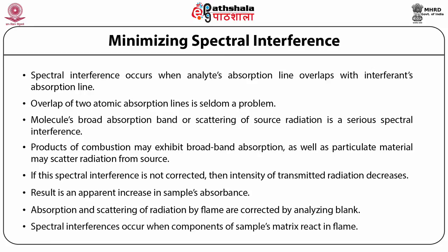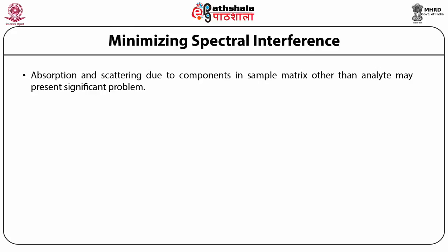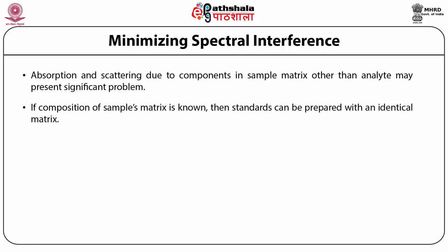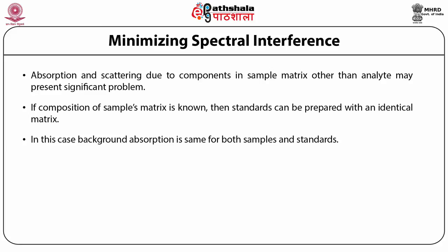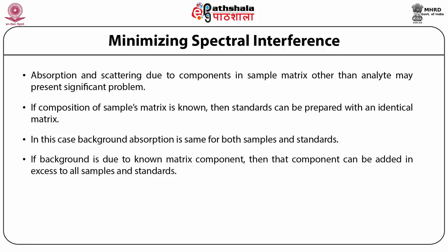Spectral interferences also occur when components of the sample's matrix react in the flame to form molecular species such as oxides and hydroxides. Absorption and scattering due to matrix components other than the analyte constitute the sample's background, which may present a significant problem particularly at wavelengths below 300 nm. If the composition of the sample's matrix is known, standards can be prepared with an identical matrix so that the background absorption is the same for both samples and standards. Alternatively, if the background is due to a known matrix component, that component can be added in excess to all samples and standards so that the naturally occurring interference becomes insignificant.